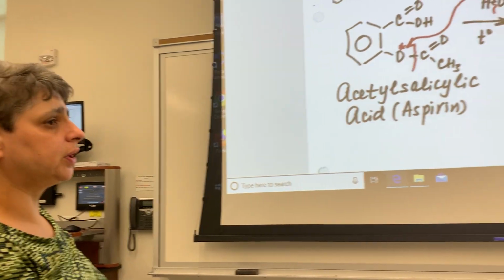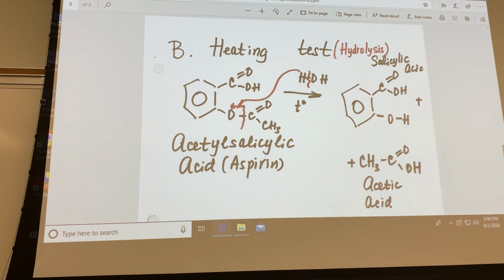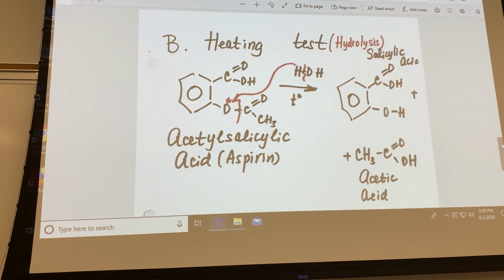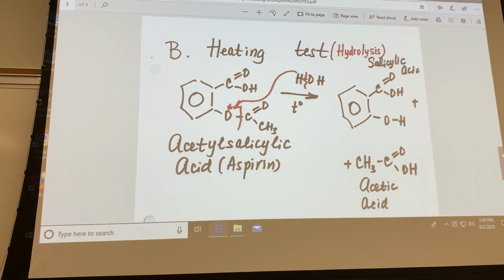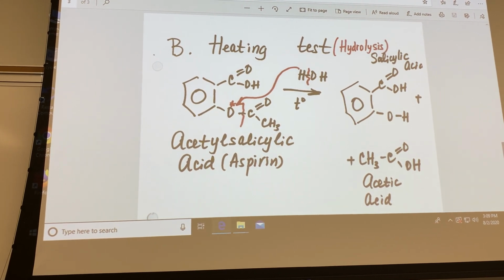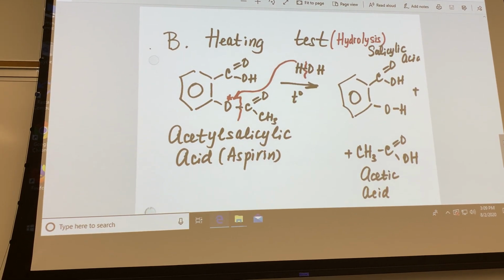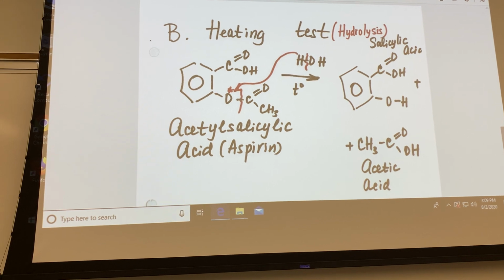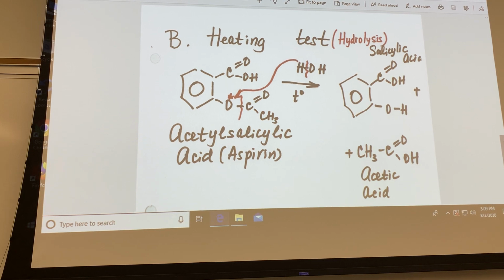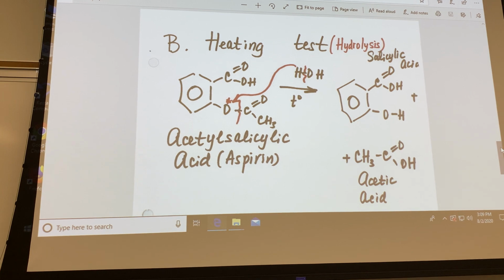You're going to safely grasp the test tube with your test tube holder, and then you're going to heat briefly the contents of the test tube in the flame of the Bunsen burner. Before you light the burner, please ensure that no one in the lab is still using ethanol for recrystallization. And heating should be done in a safe fashion, meaning mouth of the test tube pointing away from yourself and others. Heating should take only a couple of minutes, maybe even less. Usually it causes the solid to sort of liquefy, and then you're expected to very carefully smell the contents of the test tube.